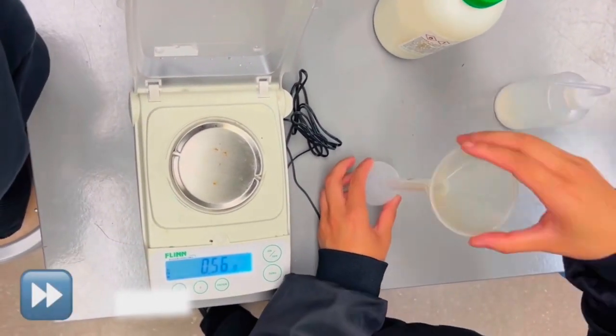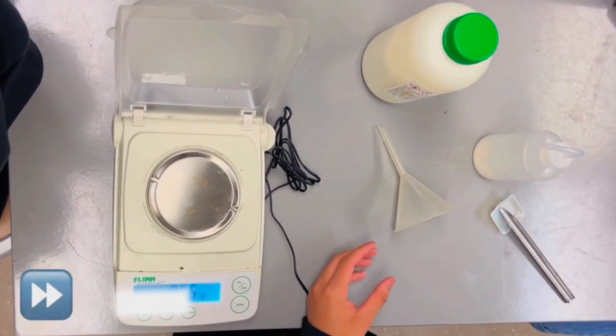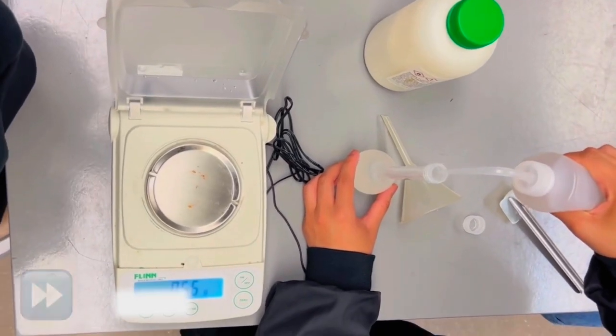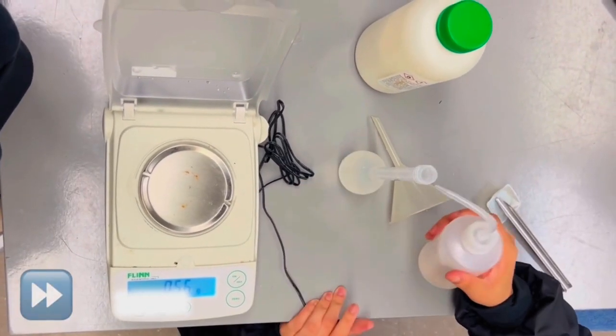If necessary, add water as you go. Once the solids are inside the volumetric flask, add some distilled water. Thoroughly mix the solution, then add more distilled water until the solution reaches the 100 milliliter line.